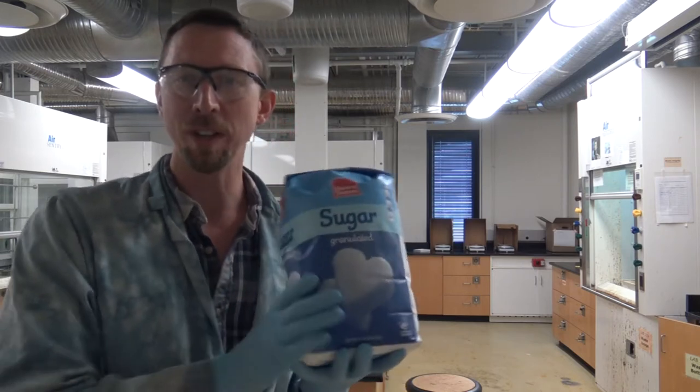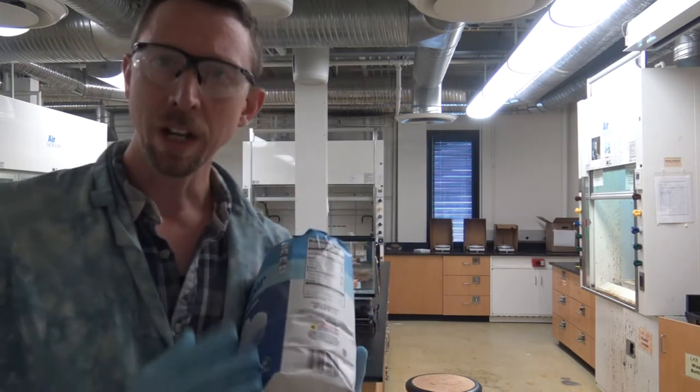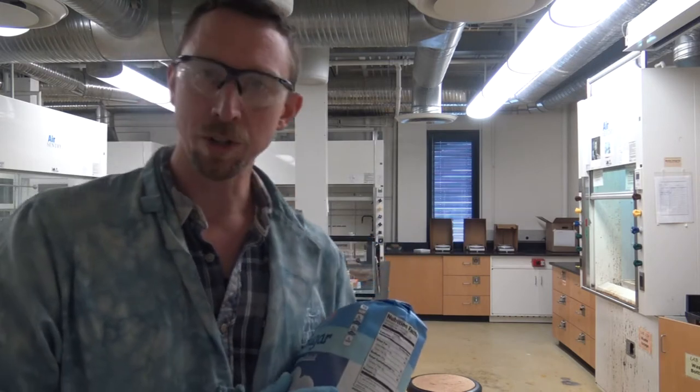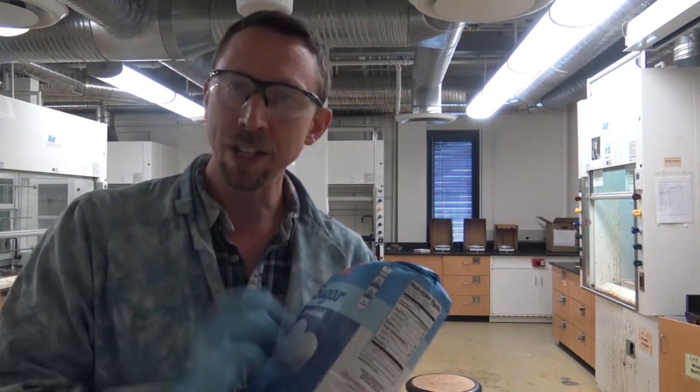So how is Dave going to pull his little disappearing act? Well I'm going to use something that's readily available to us all. Sugar purchased at my local grocery store. Now the sugar that you buy at your local grocery store is a compound called sucrose. It's a disaccharide and it is chiral meaning the molecules in this sugar are handed.